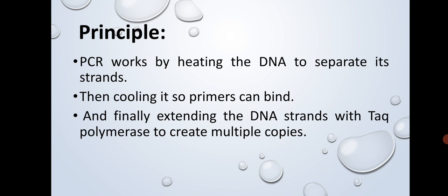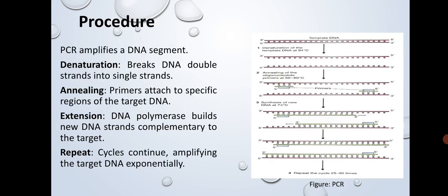Next, if we talk about its principle, PCR works by heating the DNA to separate its strands, then cooling it so primers can bind, and finally extending the DNA strand with Taq polymerase to create multiple copies.